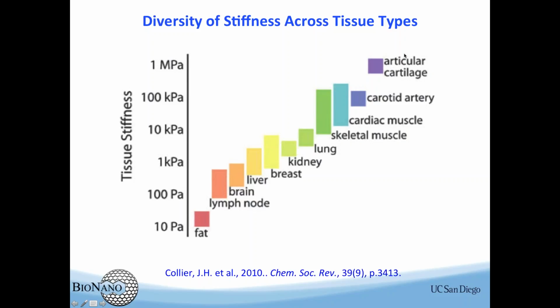So there's an essential question about what material we can use to create a scaffold that can also work with the cells. Right. So, for instance, you cannot really use ceramic materials. Ceramics are very hard and tough to use as a scaffold material to work with brain tissue, right? For brain tissue, it's very soft, so you have to use very soft hydrogel materials in this case.